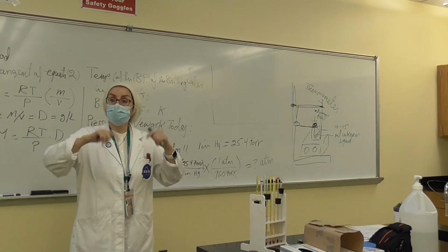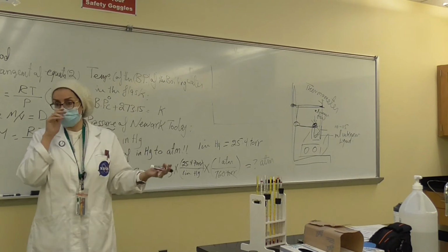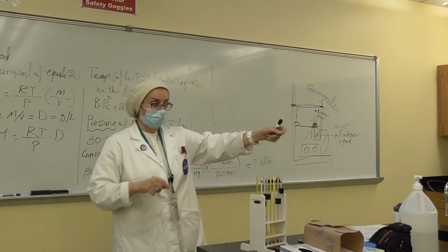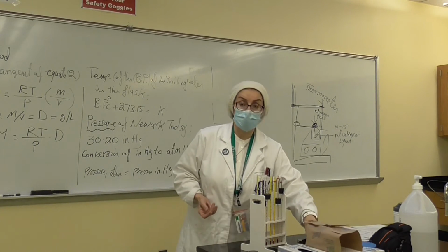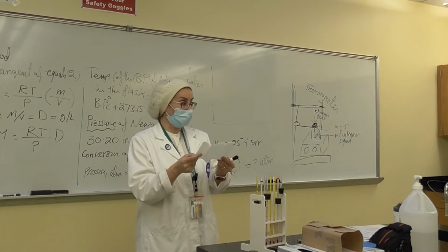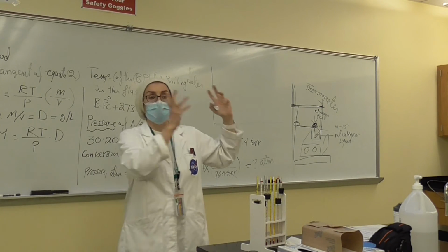When we try to cool it down, we bring the vapor back into a liquid. And then after you do that, let it run under the water for maybe a minute or so. You clean it. You are going to dry it with a paper towel. Dry the outside body of your flask and take it to the balance and weigh it.